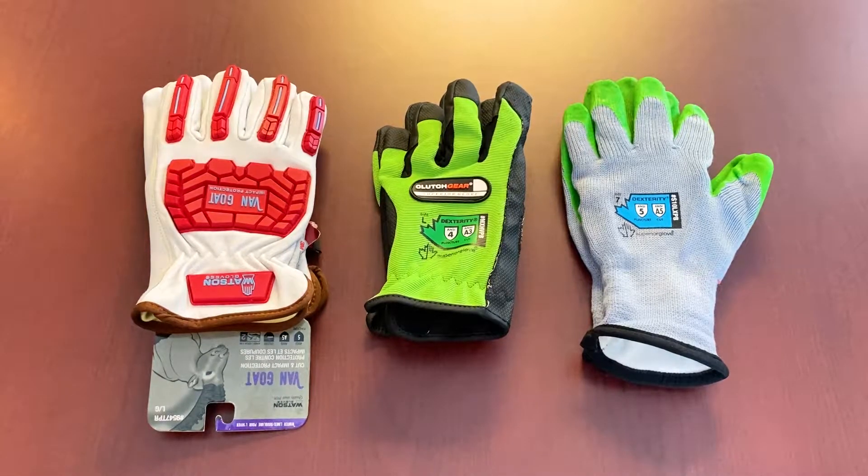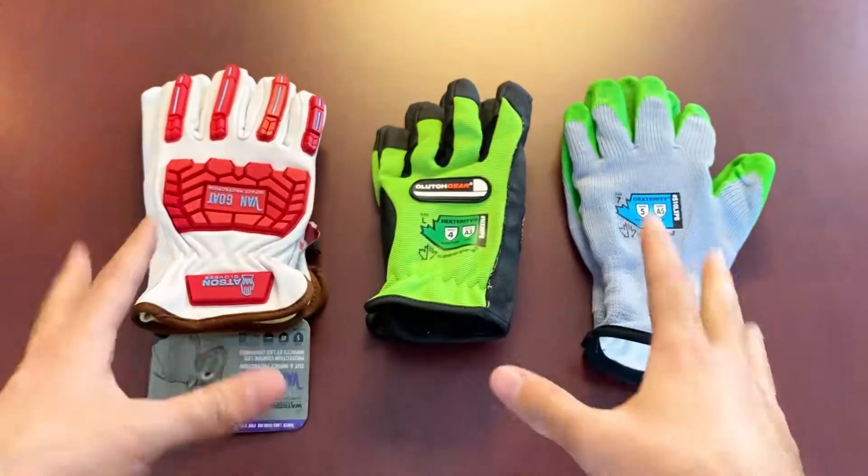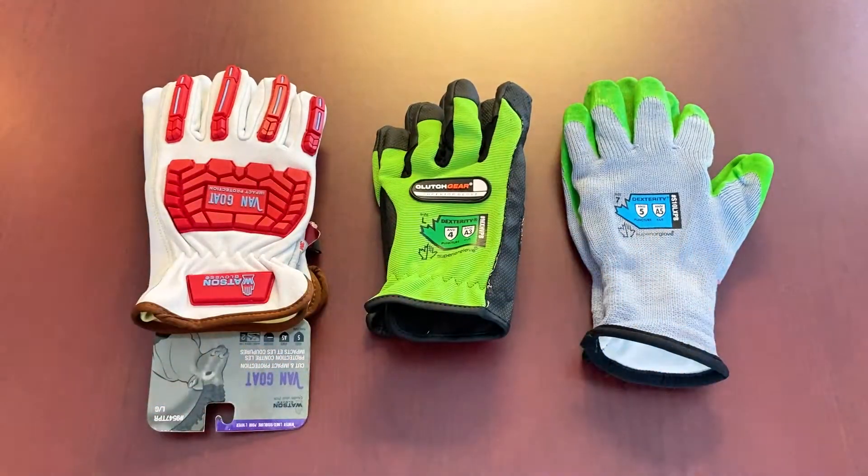Hi everybody and welcome to this week's Feature Friday. This week we're gonna be talking about a type of glove that doesn't really come up in conversation all too often, but we do have a couple options laid out in front of us here. We are talking about puncture resistance gloves.